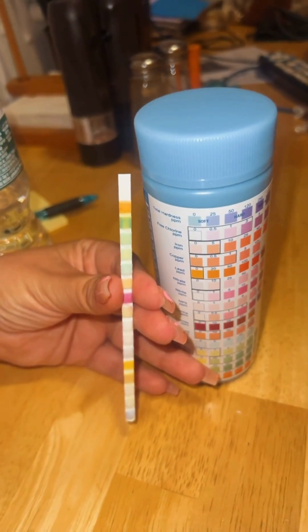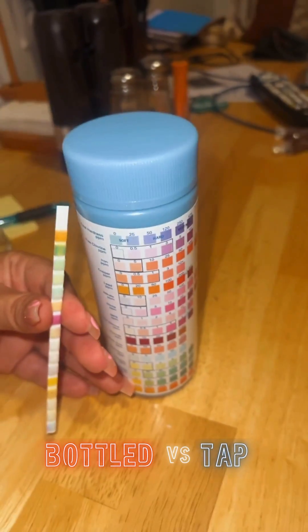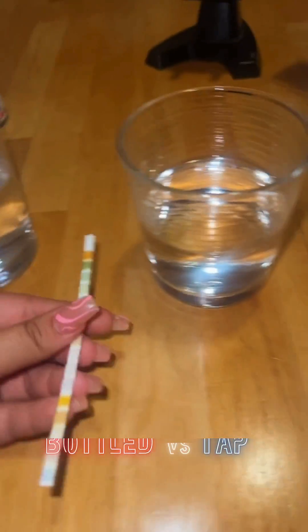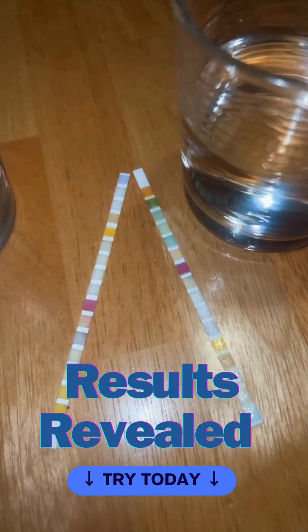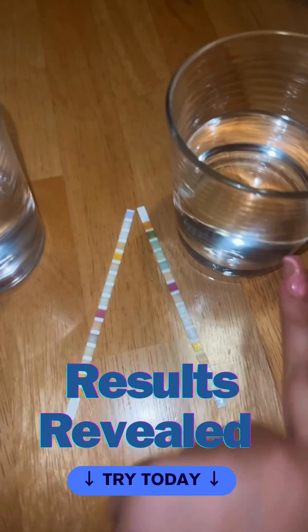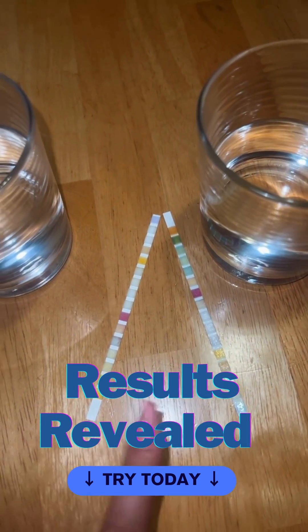With the tap water colors, we are not looking too good. When I put them down next to each other to compare, you can see a huge difference in the color test strips — this was tap, this was bottled water. This is very accurate and so easy to do.